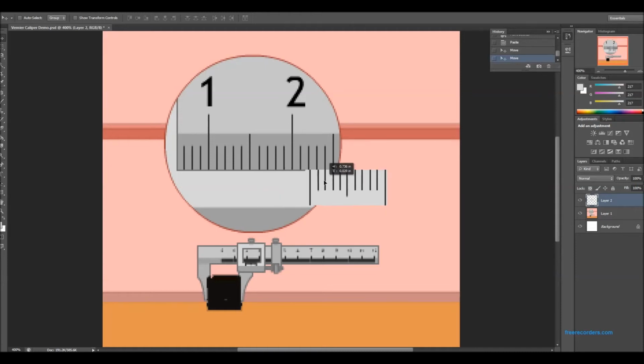So I'm going to stop this here. Okay, this cube would be 2. 2 point what? 2.1, and which one lines up perfect? None of them line up perfect. Well, I can't read this, so I have to reposition my scale. Sorry about that, kids. Why couldn't I read it? Because none of my lines lined up perfectly. None of them were a perfectly straight line. So I will reposition it here.